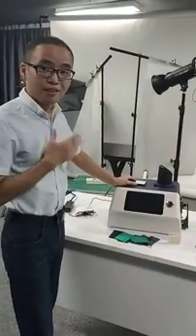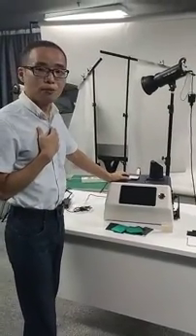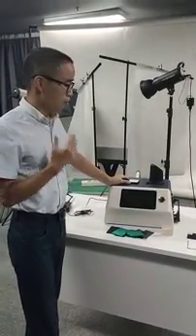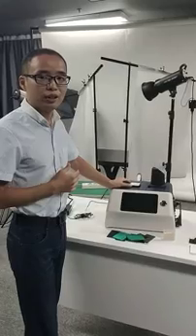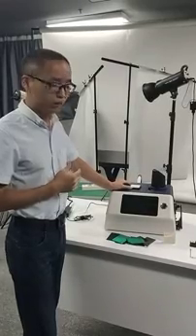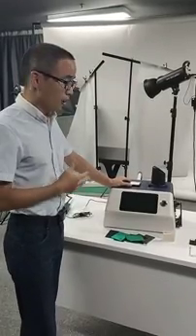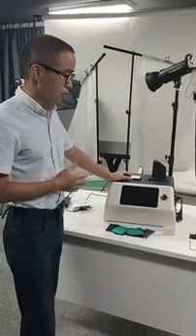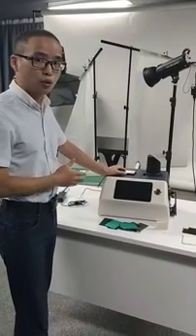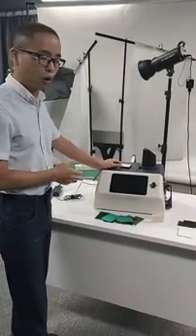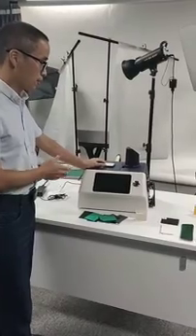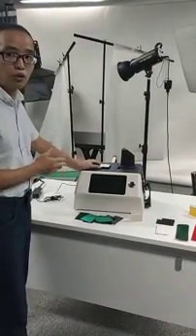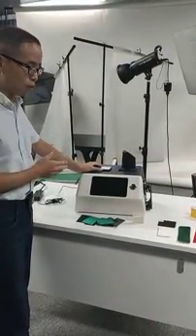Hello, this is Forrest Li. I am from Shenzhen 3NH Technology. Here I am going to give you a brief introduction to our YS6060 Benchtop Spectrophotometer.